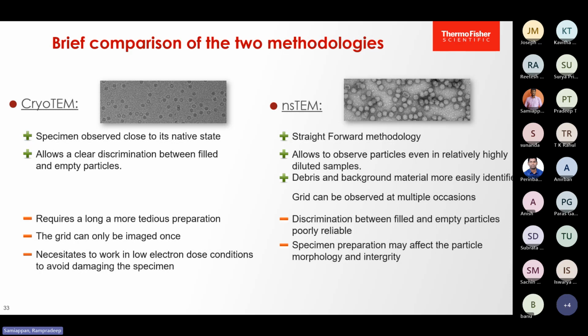NSTEM is a straightforward methodology, but with the staining agent that comes in practice, the resolution is very limited. It's too limited, so you have to just take NSTEM as a reference method. Debris and background material can be easily identified. And as I said, resolution is limited.